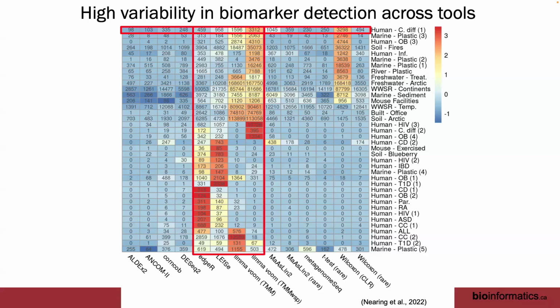That means that when we talk about biases, what you report as significant will vastly differ from what someone else did, even though they had possibly the same data, but they just applied a different differential abundance method. A statistician would come at this and say, well, they make different assumptions about the underlying data, of course, and it's not surprising that they're different. We don't expect them to overlap perfectly, but I think we were a bit surprised at how much of a range there was here. And some of them were more conservative, so that's great.